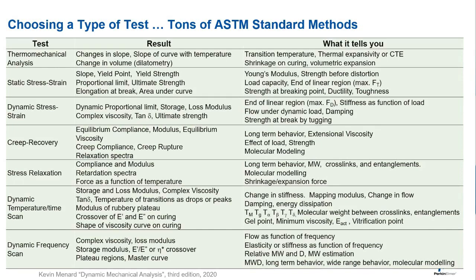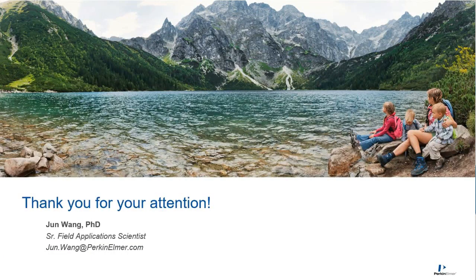DMA is a state-of-the-art technique. When you have learned how to use it, it's a wonderful tool for the characterization of the mechanical properties of a wide range of materials. And this concludes my presentation today.